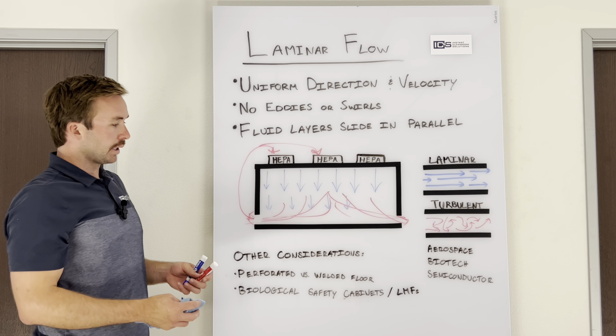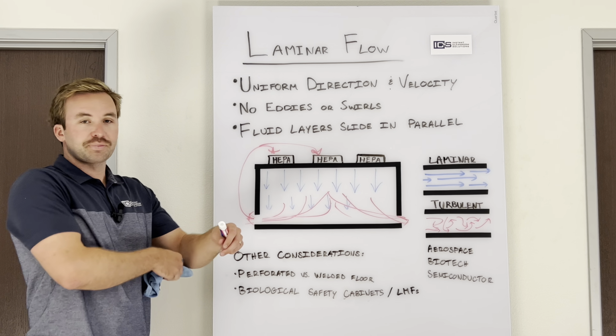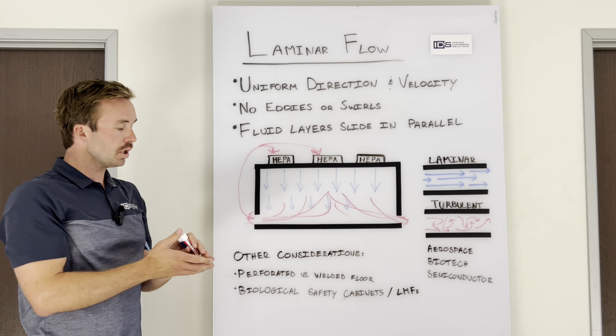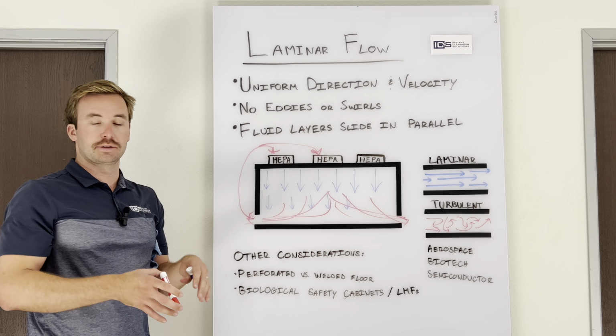So some of our mobile clean rooms are designed for pharmacy compounding and clinical trials, designed with CGMP regulations, and those are going to have the welded vinyl floor. Other of our mobile clean rooms, and clean rooms that we can build for you, whether it's a custom modular clean room or one of our instant clean rooms, we can design with perforated floors. Really depends on what industry you're in.